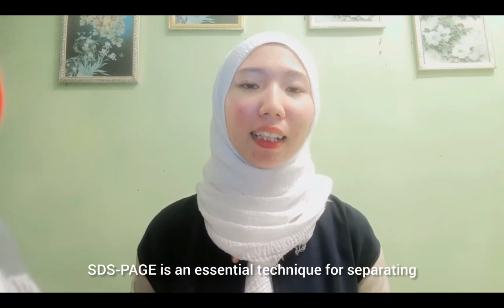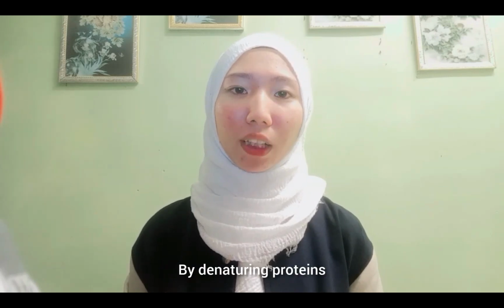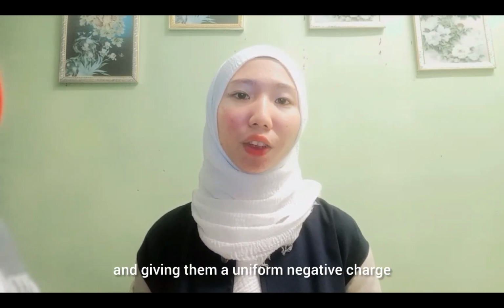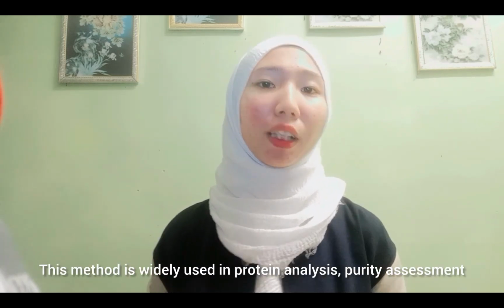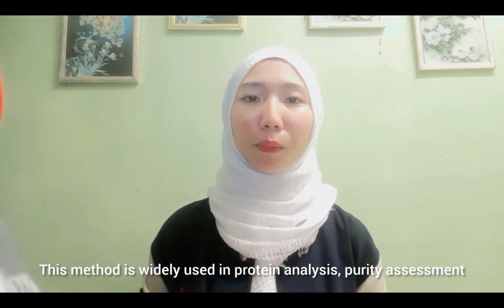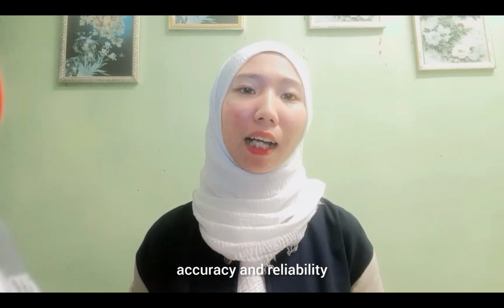SDS-PAGE is an essential technique for separating proteins by size using an electric field. By denaturing proteins and giving them a uniform negative charge, it ensures separation based on molecular weight. This method is widely used in protein analysis, purity assessment, and molecular biology research due to its accuracy and reliability.